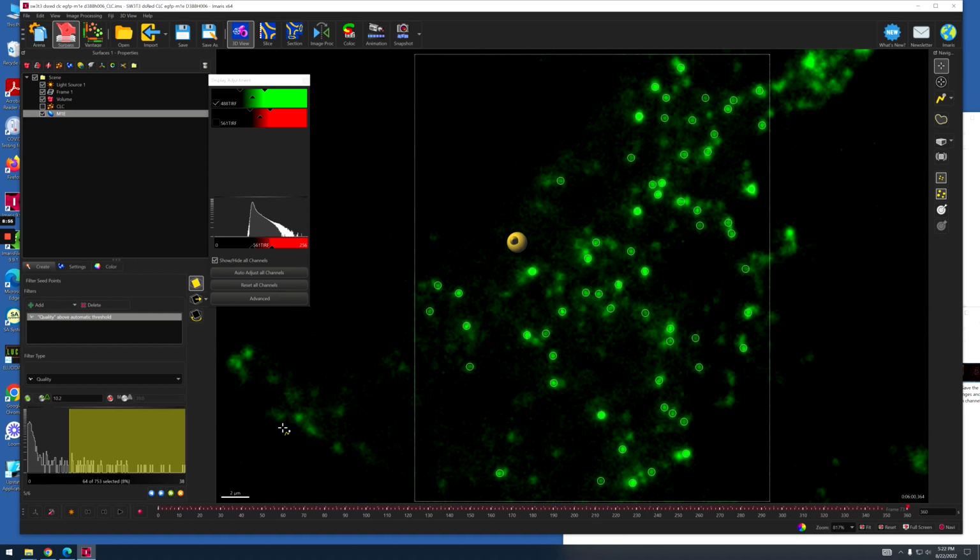Now it looks like there's a lot of stuff that's not being detected, but most of them are selected. Let me see if I can use quality to get all these spots to be detected.